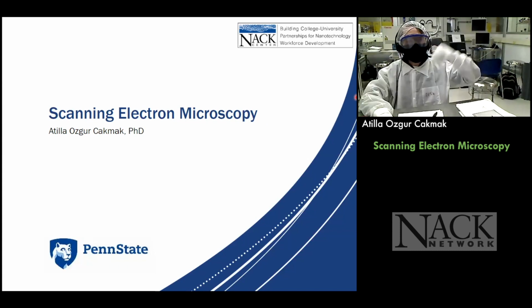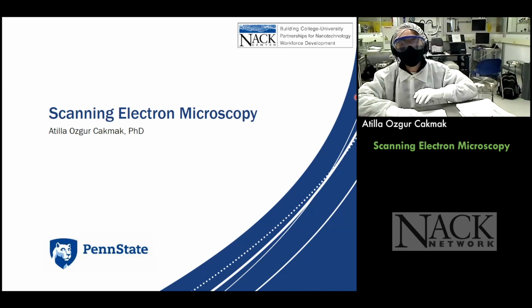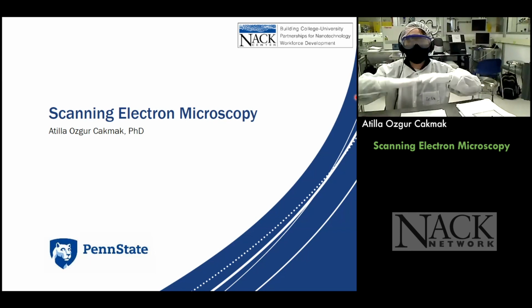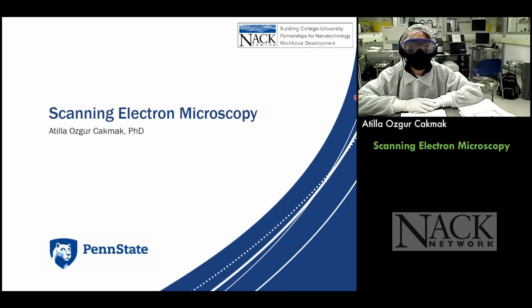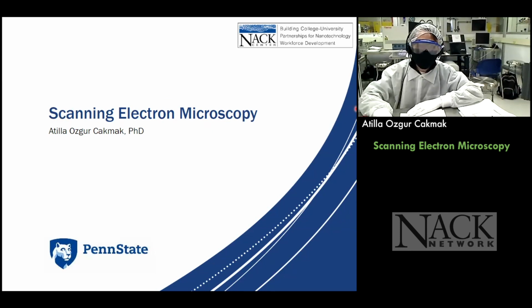So I'm Ozgur. By the way, I'll be with you in the advanced part, the upcoming workshop. So I'm saying advanced all the time. It's actually not extremely advanced. It's just a slightly deeper dive, but again, not into the depths. We're trying to aim so that you can teach these in your community colleges and in your four-year degree schools. So we'll abbreviate this characterization tool as SEM simply.